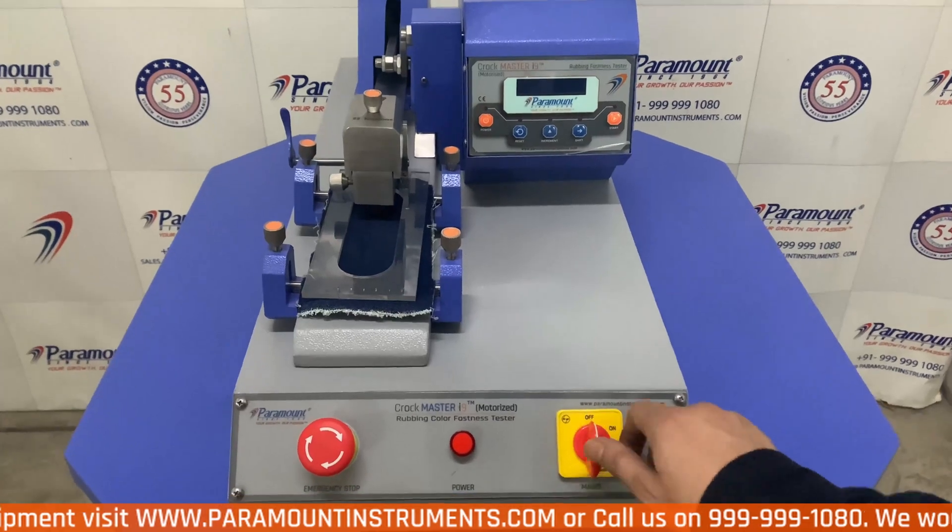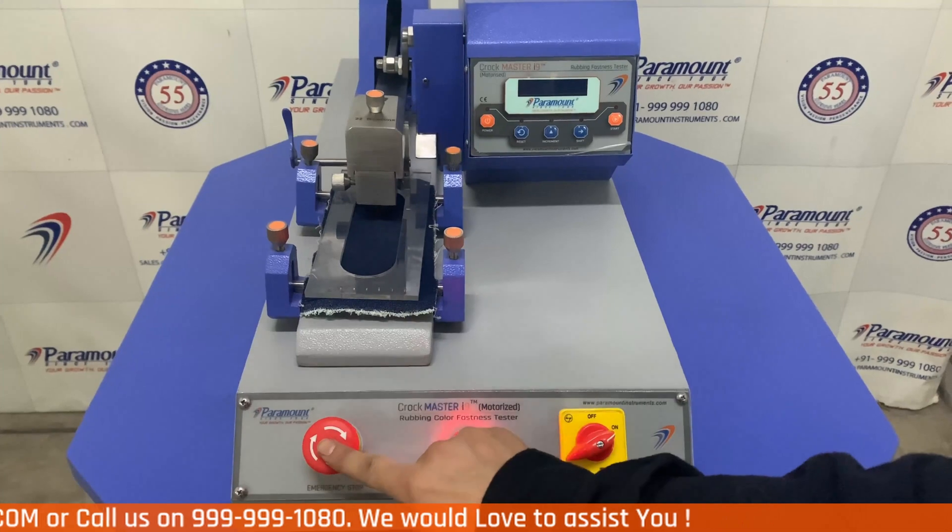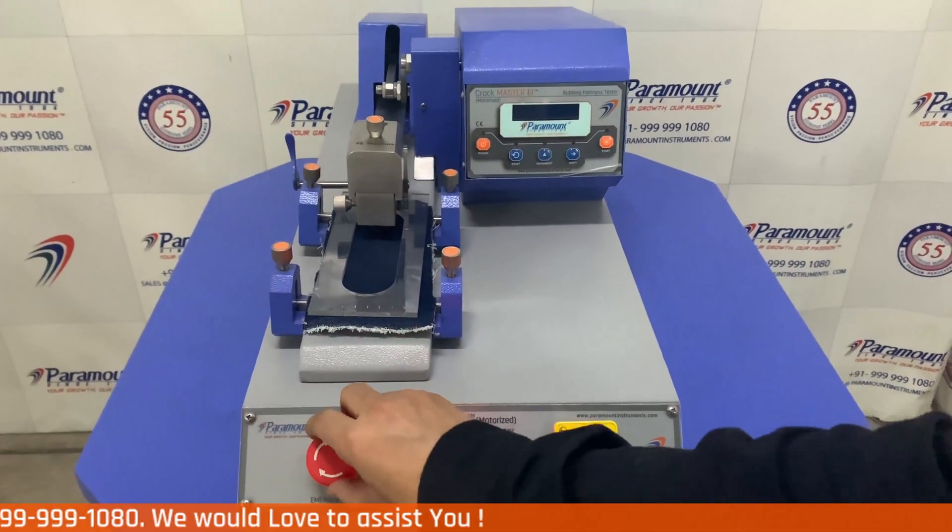This is the main on-off switch. This is the power LED indicator. And this is the emergency start-stop switch for safety norms.